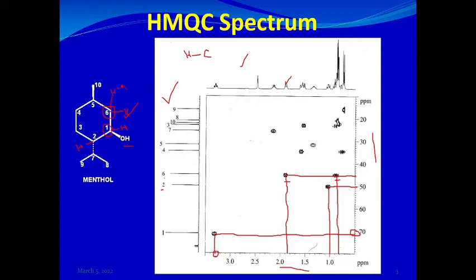Carbon number four is also a CH2 with diastereotopic protons, so we again see two different proton values mapping to the same carbon. The carbon resonates at about 34 ppm. Going down on the proton scale, one proton resonates at about 1.5 ppm and the other at about 0.7 ppm. So the two protons attached to carbon 4 resonate at 0.7 and 1.5 ppm.